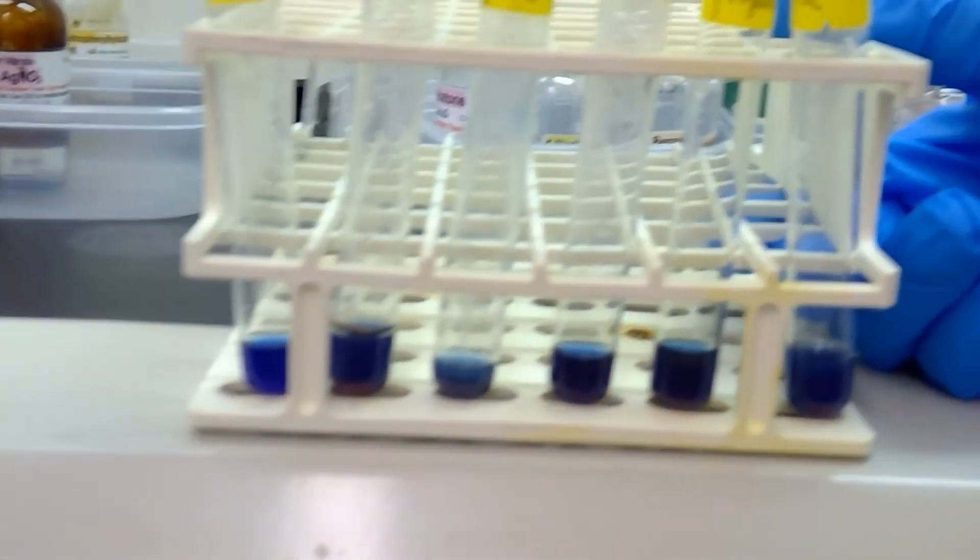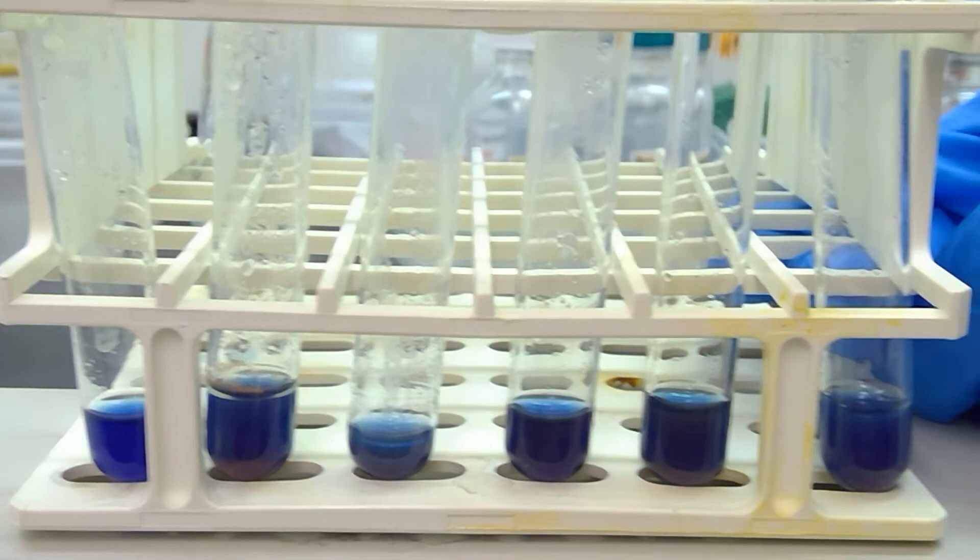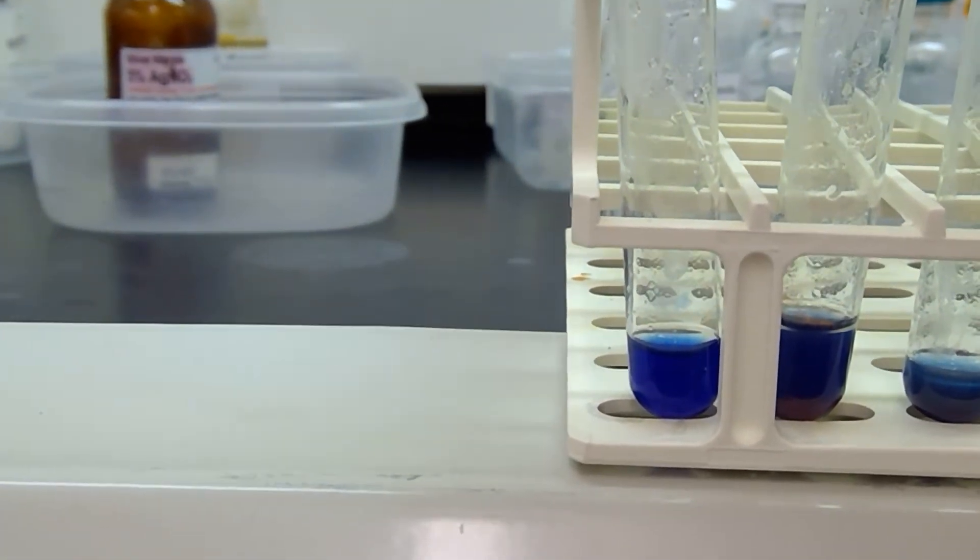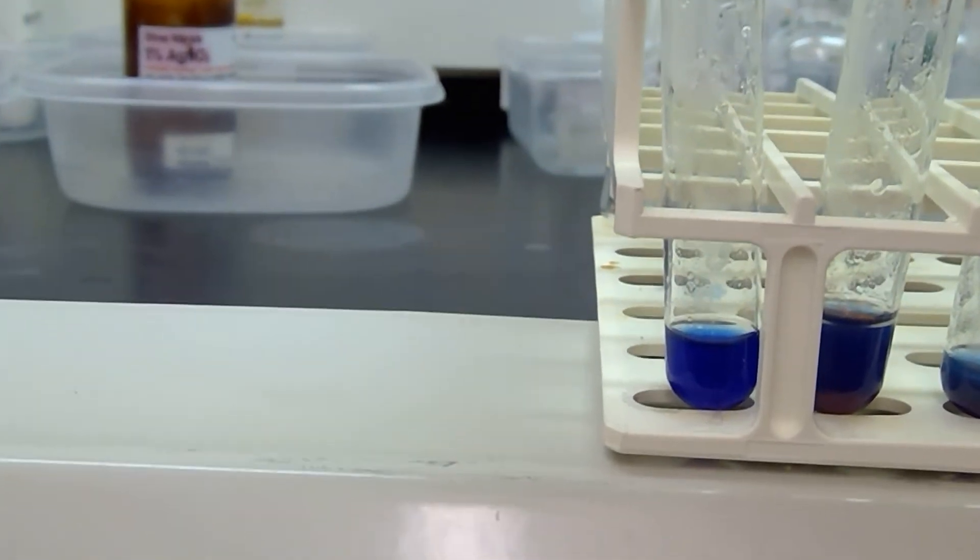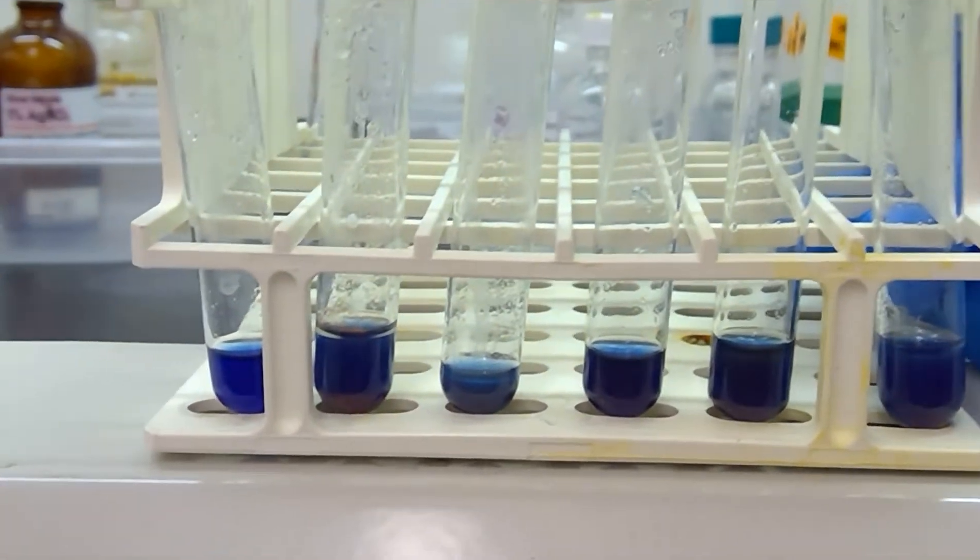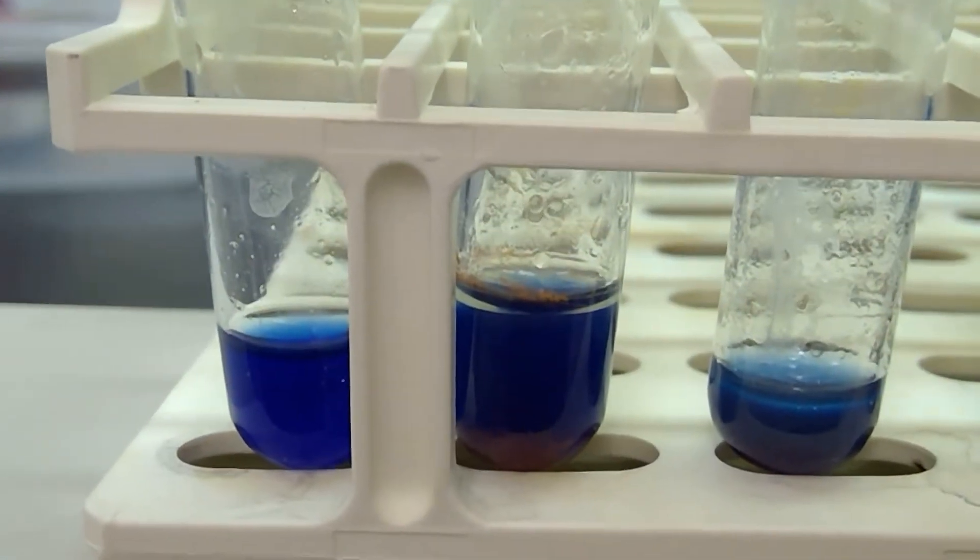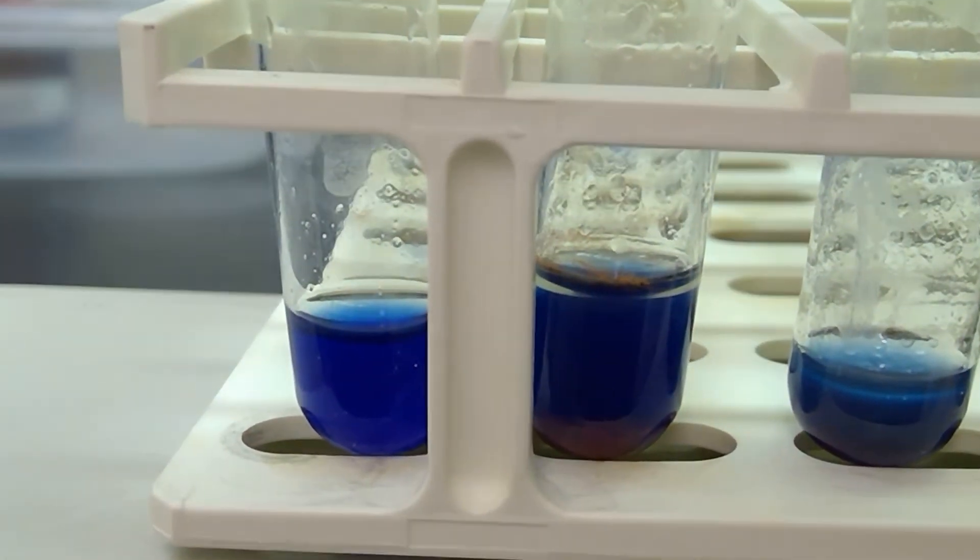First on the left we have acetone. Acetone did not change colors and we expected that because it is a ketone. Next up we have heptanal, and heptanal has a nice red rim of solid around it. I'm going to go ahead and spin it around so you can see that we have some solid precipitate that persists even towards the bottom of the test tube.